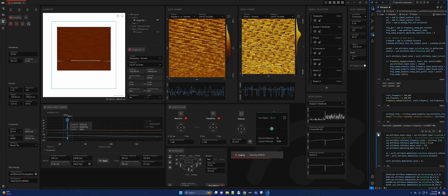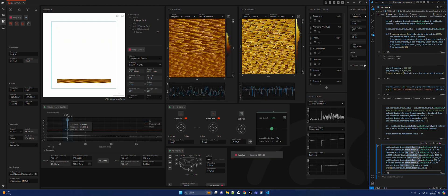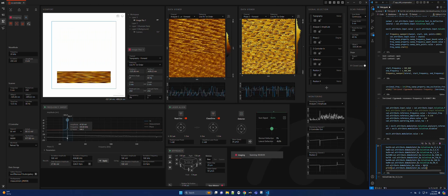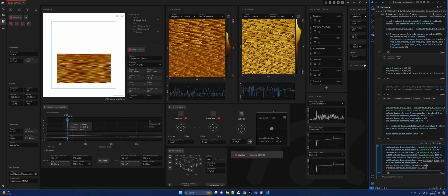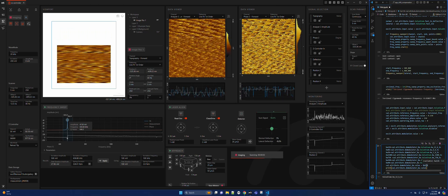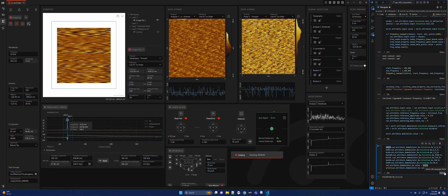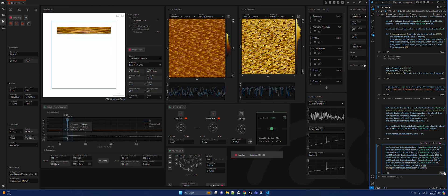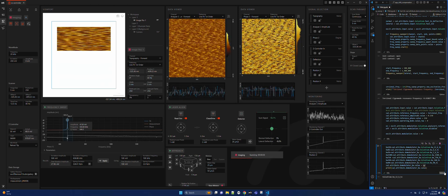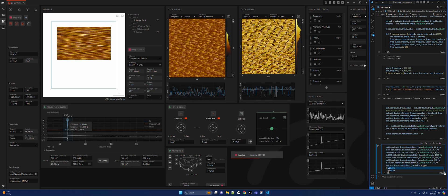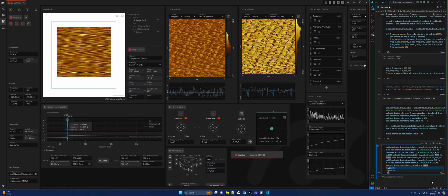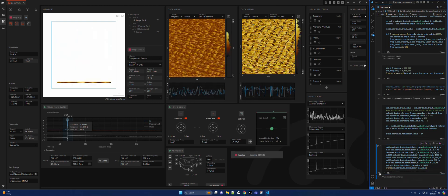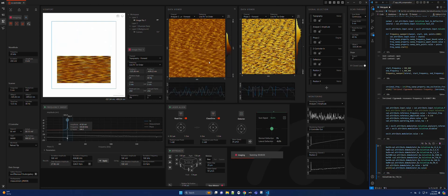Go back to 250. I also can change the filter - right now I have it at full bandwidth at 12 kilohertz, but I can reduce the bandwidth and reduce some of the noise that you see there. So I can go down to let's say 750 Hertz. You can see how that affects the image quality.